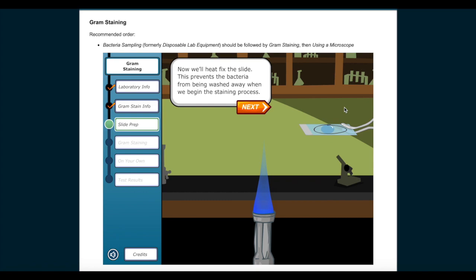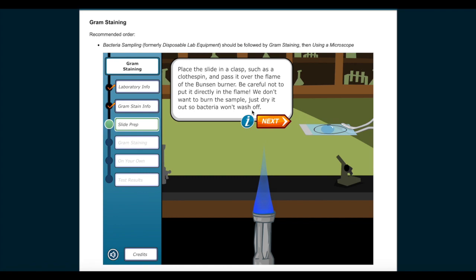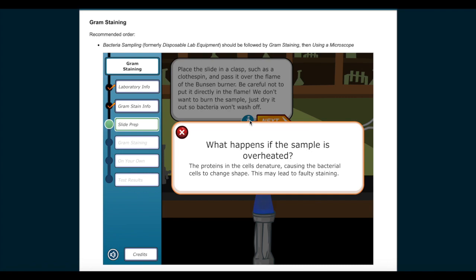Now, we'll heat fix the slide. This prevents the bacteria from being washed away when we begin the staining process. Place the slide in a clasp, such as a clothespin, and pass it over the flame of the Bunsen burner. Be careful not to put it directly in the flame. We don't want to burn the sample, just dry it out so bacteria won't wash off. What happens if the sample is overheated? The proteins in the cells denature, causing the bacterial cells to change shape. This may lead to faulty staining. Hold the slide over the flame to dry it out.